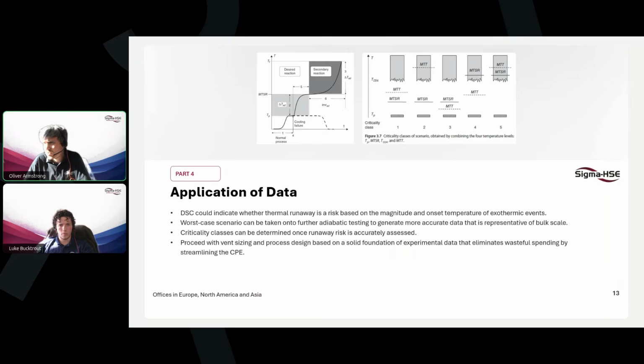So we see a demonstration of that on the plot on the left, where we may have a desired process within that region 1, where we have a batch of materials and we heat it up to the target process temperature, or TP, in order to commence the reaction and result in our product at the end. So following the desired reaction, we heat it up, the reaction commences for some time following the dotted line, and we cool the batch back down again with our product.